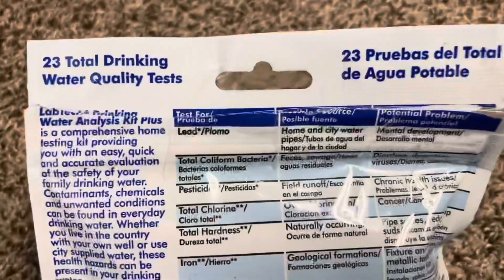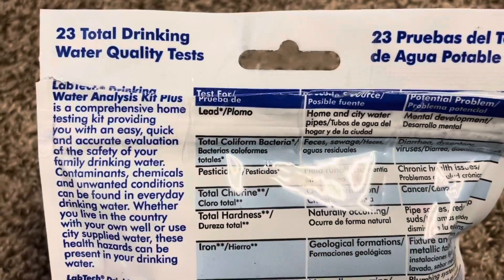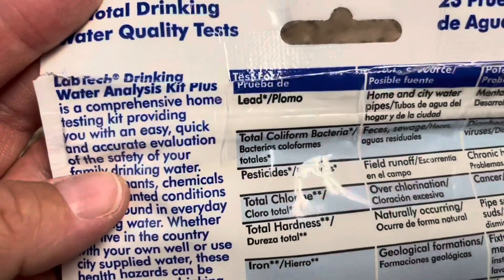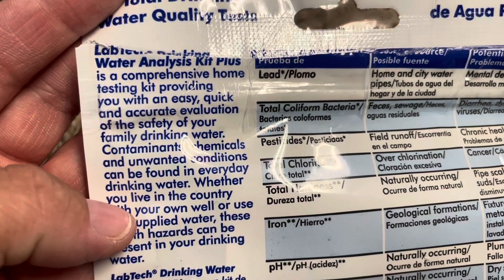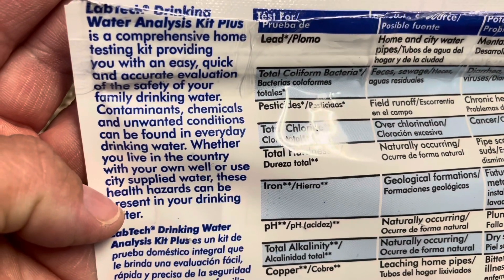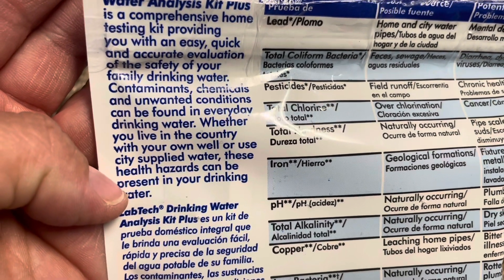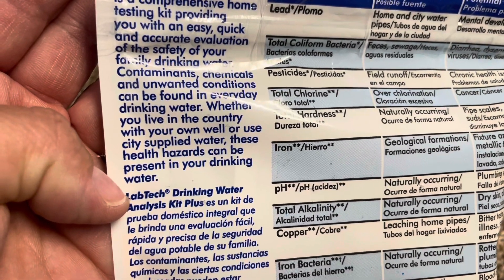On the back it says 23 total drinking water quality tests. The Lab Tech Drinking Water Analysis Kit Plus is a comprehensive home testing kit providing you with an easy, quick, and accurate evaluation of the safety of your family's drinking water. Contaminants, chemicals, and unwanted conditions can be found in everyday drinking water, whether you live in the country with your own well or use city-supplied water — these health hazards can be present in your drinking water.